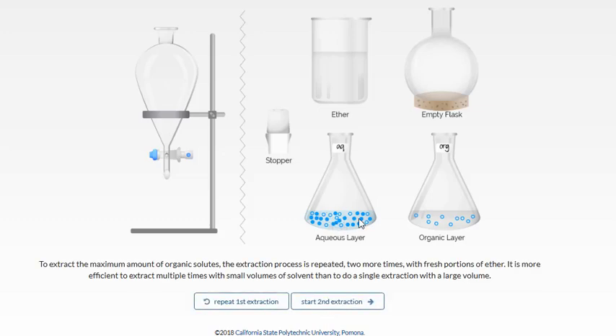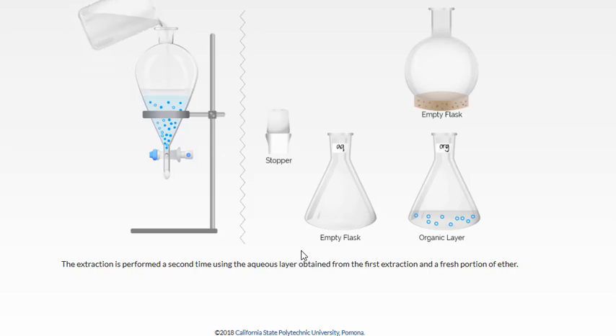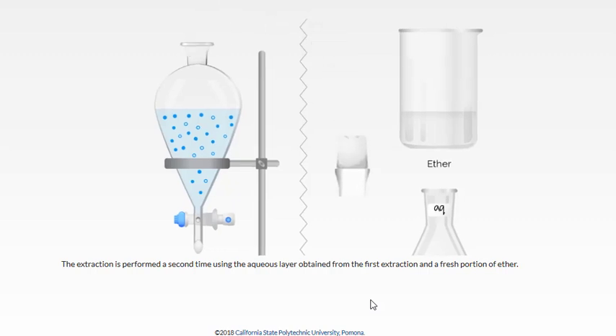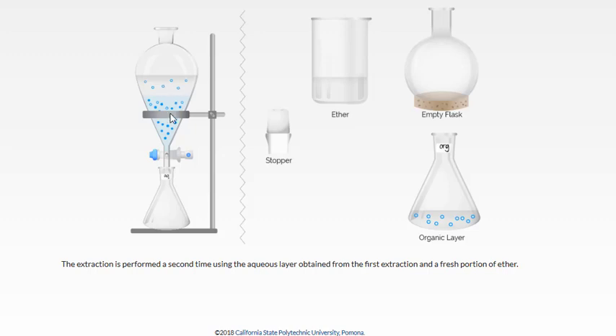Because the aqueous layer still contains some of our desired compound, we're going to do a second extraction. Pour the aqueous layer back into the sep funnel, use another fresh portion of ether, and then mix these again. Add the stopper to the top and, while securing it with your finger, mix with periodic venting. Another portion of our desired compound will move over to the organic layer.